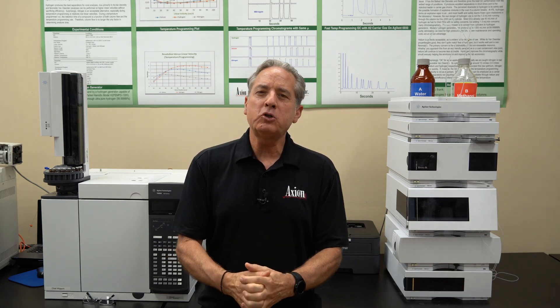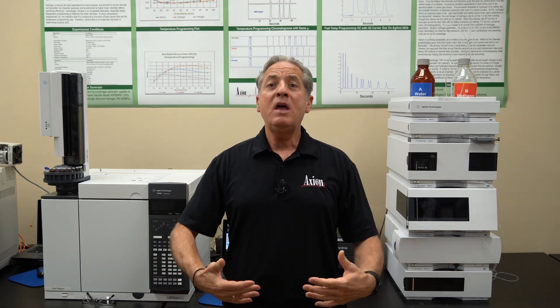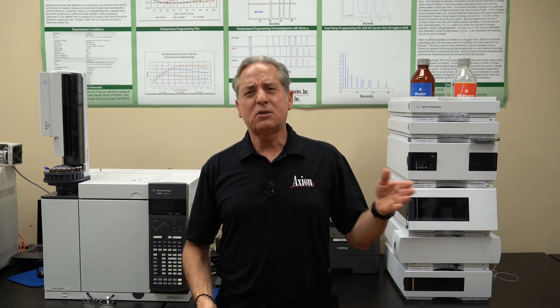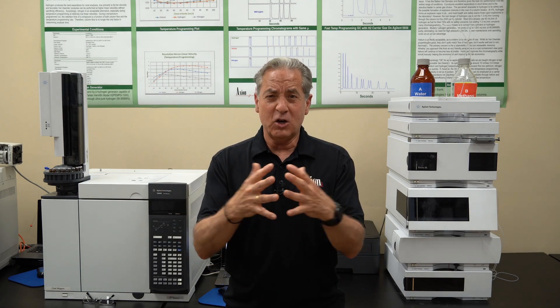Then we're going to talk about troubleshooting. What if things don't go the way you want? We're going to troubleshoot the equipment and then maintain it. You're going to change columns, liners, gold seals, O-rings, septa, and detector lamps — and you'll get the experience you need to do that in your own lab.